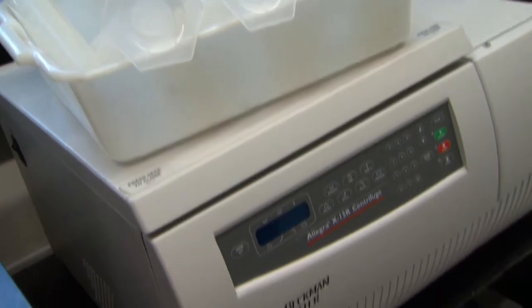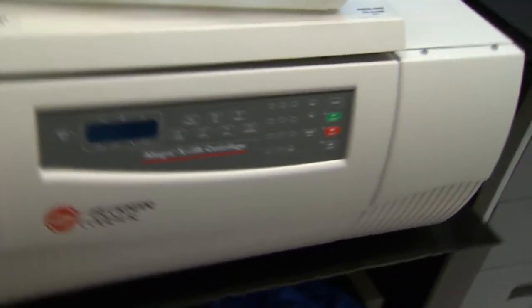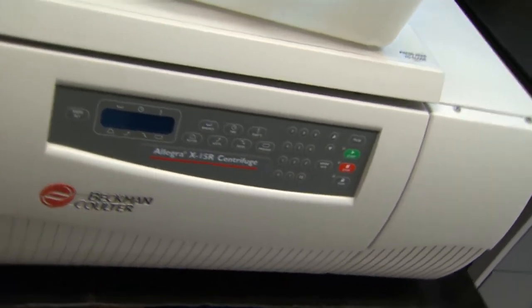Over here we have a large centrifuge. This is a particularly fancy one, it can do all kinds of things. Students may have the opportunity to use this in the course of their environmental science studies.